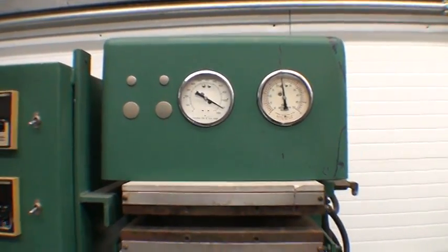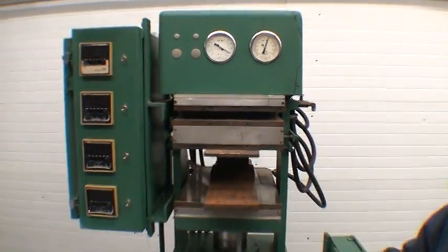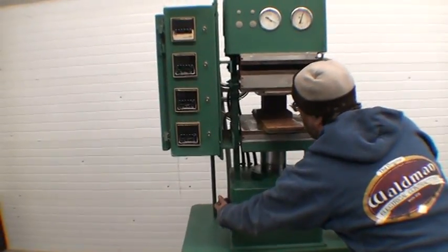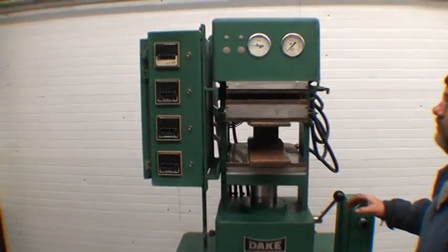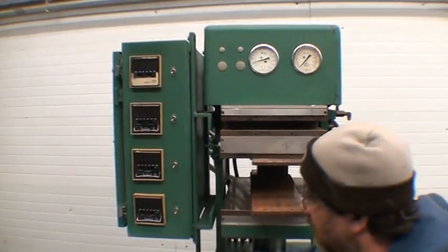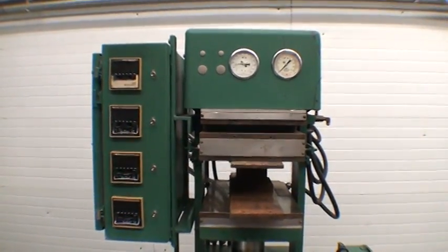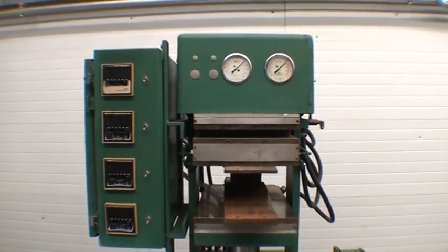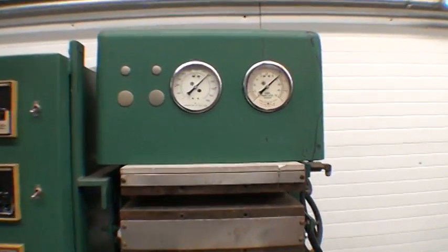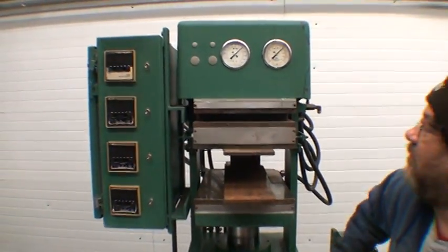The hand pump will pump it all the way up to 50 tons, but the electric pump only gets it to 30 tons. The pump appears to be a little worn out, so it only goes up to 30 tons with the electric pump — that's maxed out. But you can go all the way up with the hand pump.